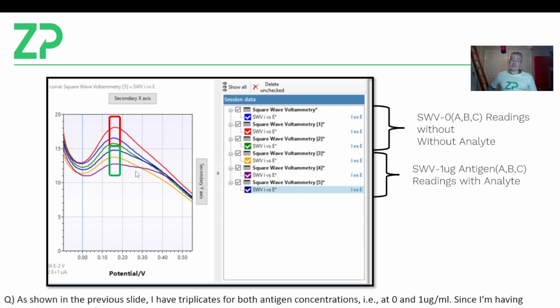Then after that, somebody is functionalizing these electrodes to be an immunosensor. Functionalization is a multi-step process. That is definitely a source of reproducibility concerns when making biosensors. At ZP, we are ISO 13485. We have air-conditioned labs, we have robotics, we have calibrated pipettes, calibrated balances. Everything is really controlled to make sure that we can get reproducibility of functionalization. I think startups and academic labs really struggle with that, but it's not a criticism, it's just a fact.